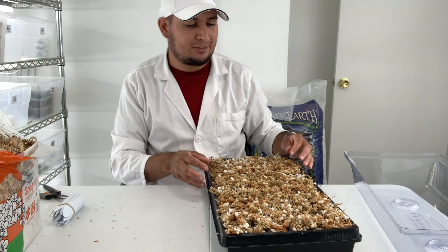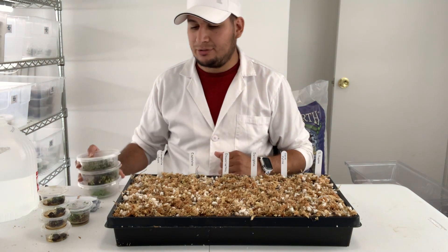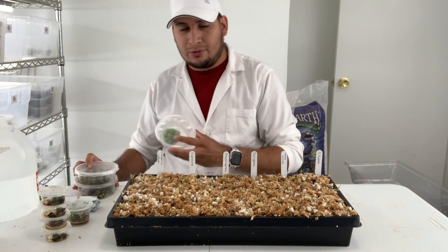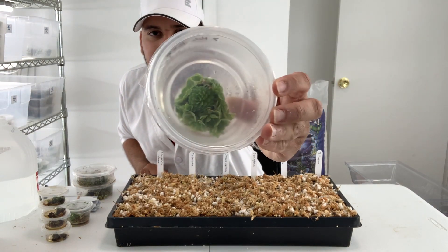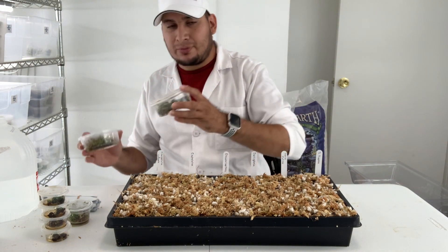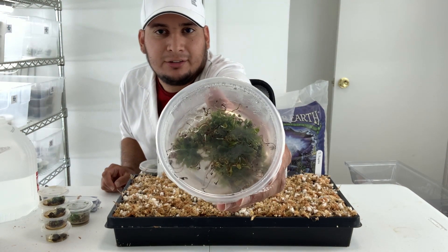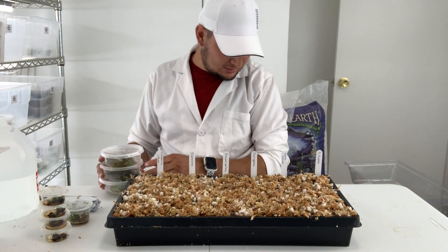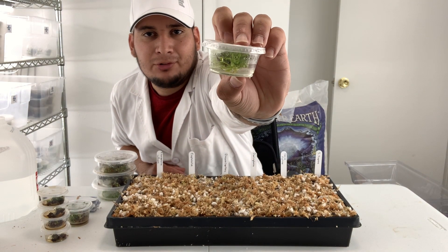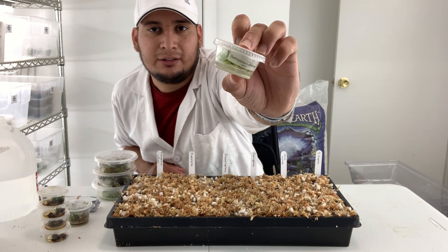Now let's get started with the plants. I already have the labels here and I have my tissue culture plants I'm going to be moving. I want to start with a Pinguicula. I also have some very old Cephalotus, Drosera capillaris, some very young Darlingtonia californica — I'm not sure how it's going to do since it doesn't have any roots and it's quite warm in this room.